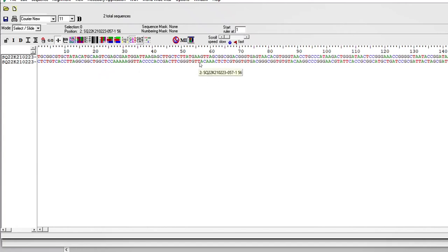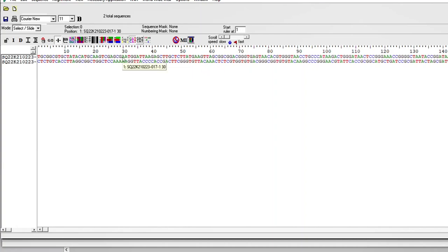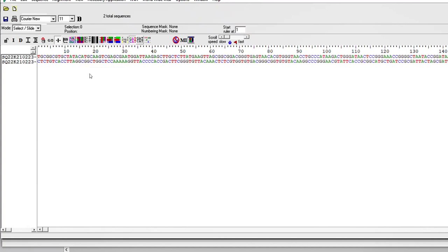We want to strip off the bad quality sequences at the end and at the beginning. We had previously opened the forward strand, and now we are going to open the reverse file.